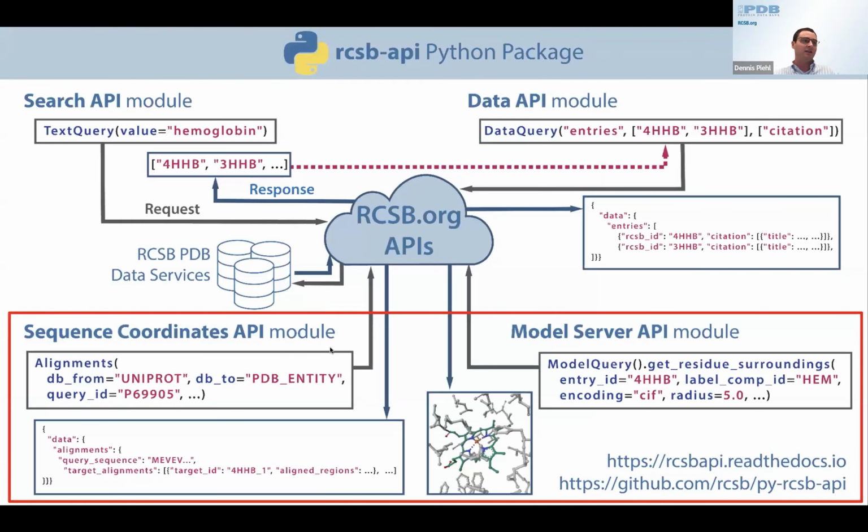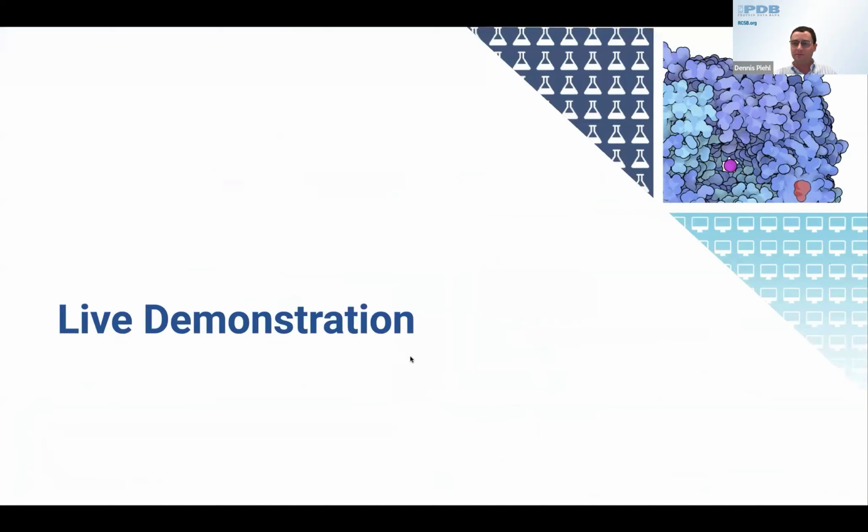All right, so now coming back to this figure, we can begin to take a closer look at how these APIs can be accessed and utilized via the RCSB API Python package. So we'll now step into the live demo part of our webinar.